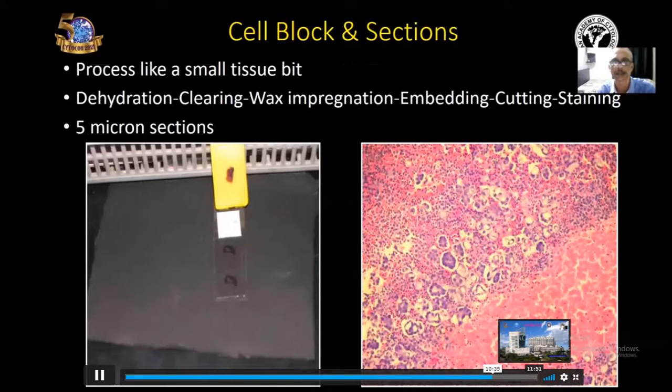Five micron sections are cut from the cell block. Here you can see how the cell block will look like and this is the sections cut and stained slide and this is the microscopic feature of the cell block sections.